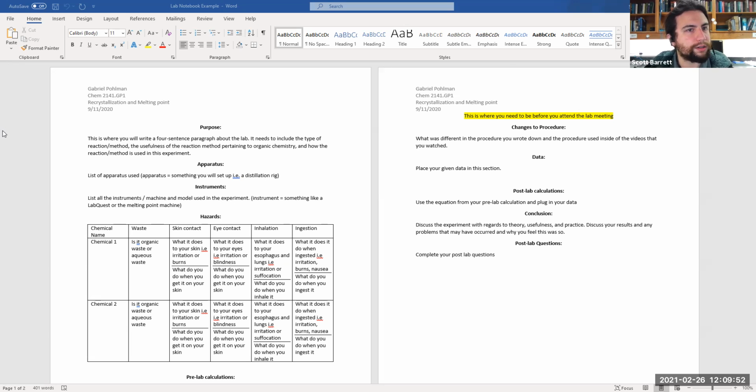One critical answer that I noticed most people forgot to mention was if you put a hot solution into an ice water bath. This is a good measure for anything in regards to chemistry or even real life example. Never put hot glass into cold water or into cold really fast, because it can shatter. So if you placed a hot solution into an ice cold bath, not only would it mess up the sample in terms of the recrystallization method, it would also potentially shatter the glass and then spill your entire solution into the ice water, and then you'd basically ruin your experiment.